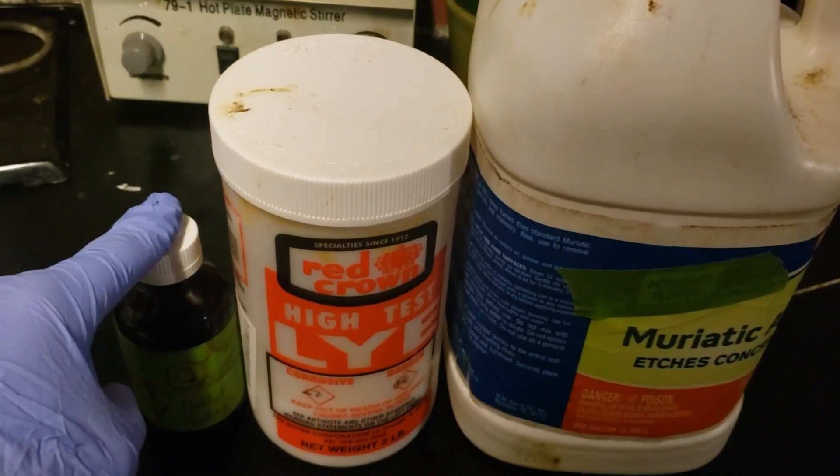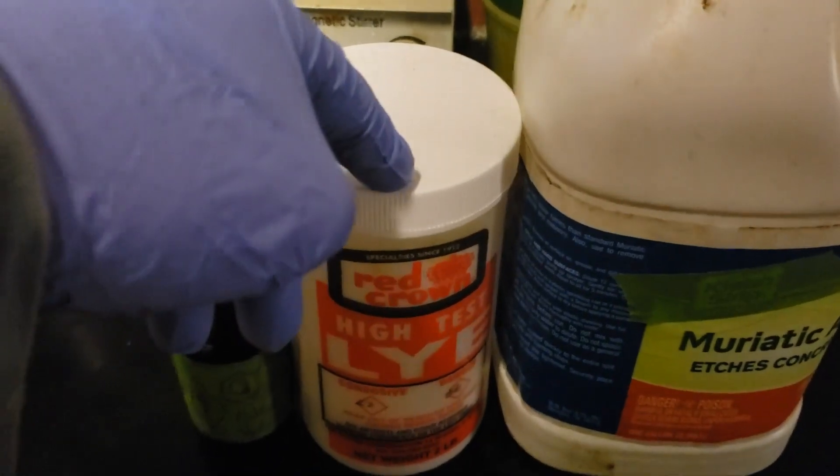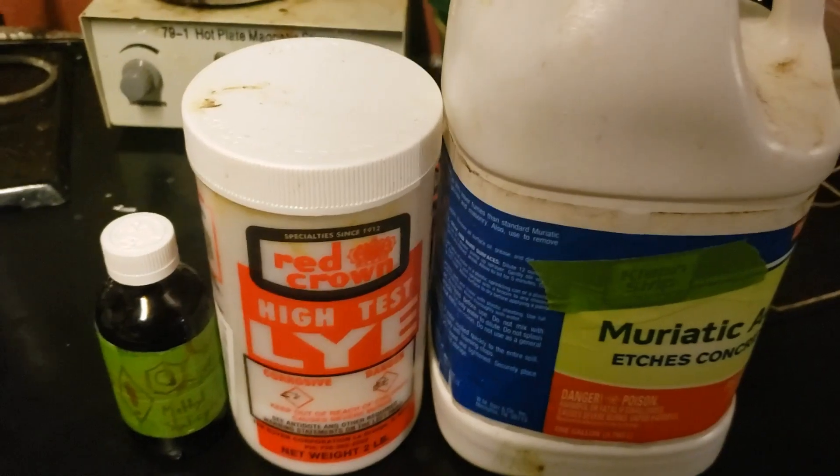You will need wintergreen oil, which is 90% methyl salicylate, sodium hydroxide pellets, and 20% hydrochloric acid. Now let's see the chemistry.